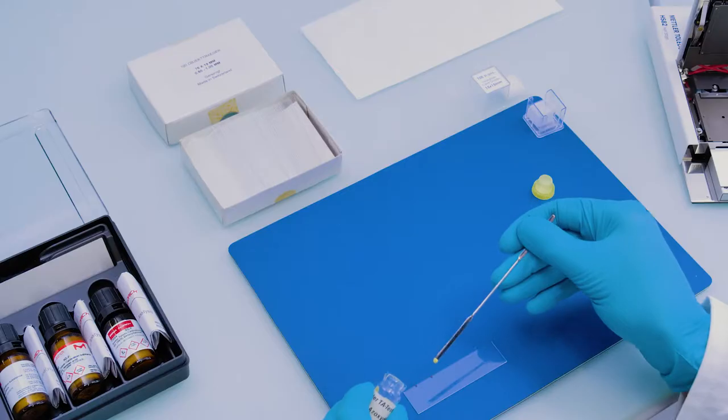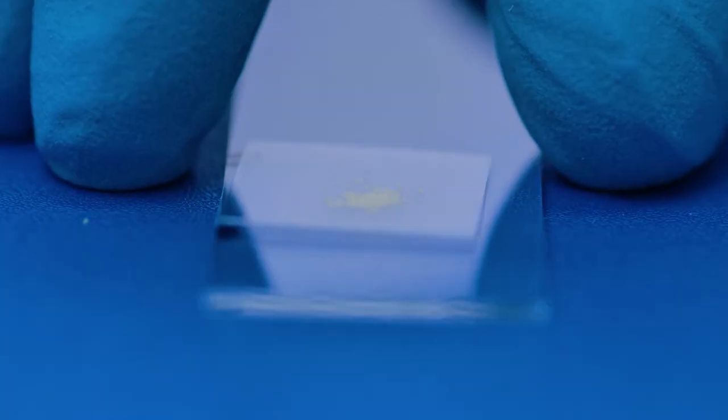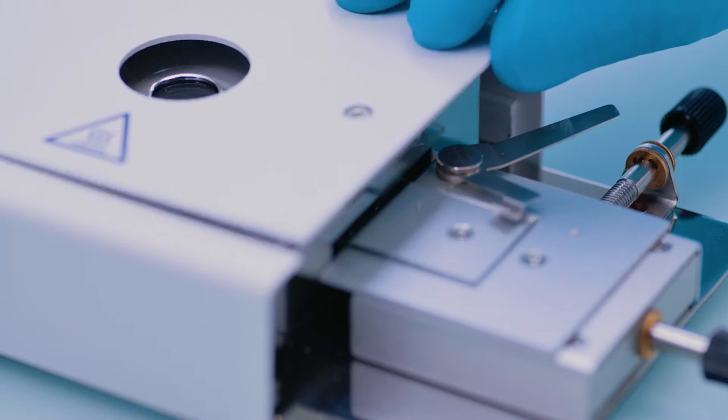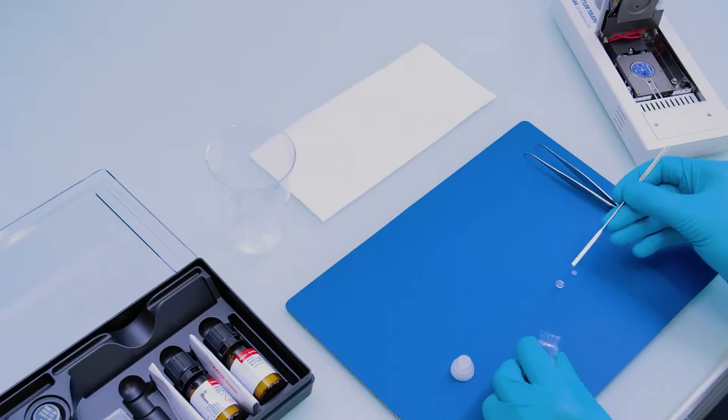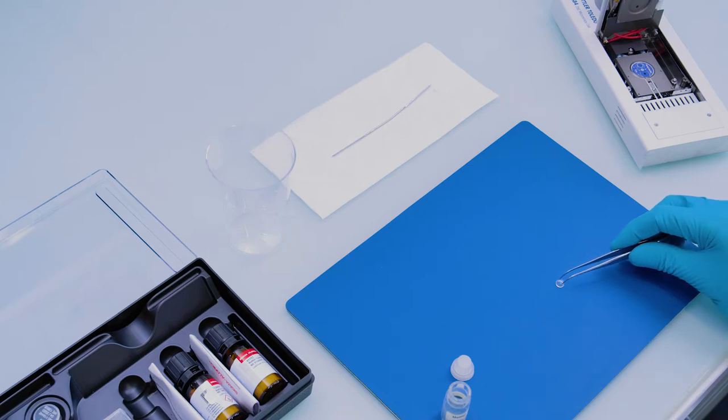In the HS82 you place samples between a microscope slide and a small glass cover, whereas in the HS84 transparent glass or sapphire crucibles serve as the sample containers.